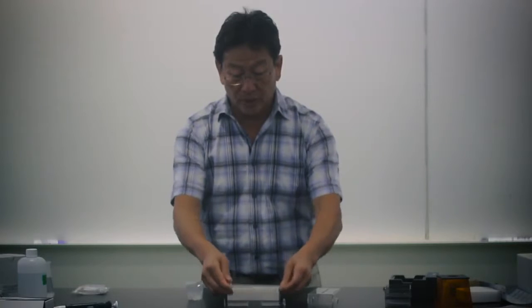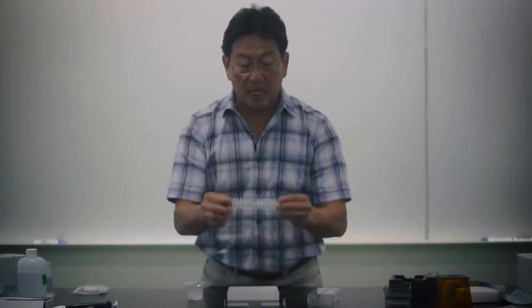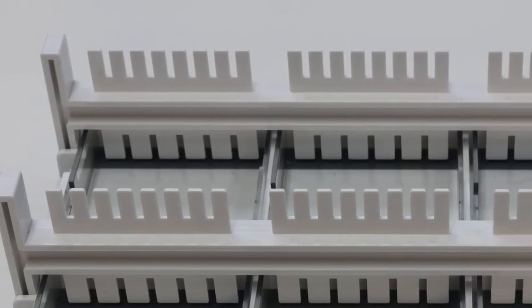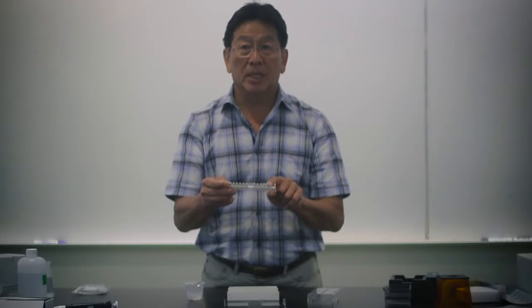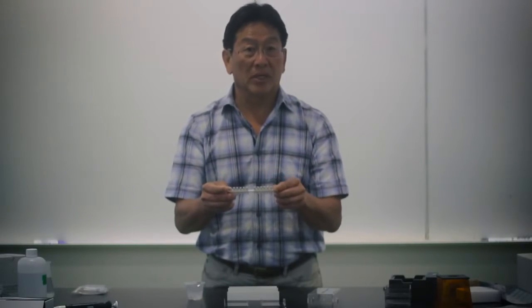Every system comes with two trays, and these trays are made with fairly thick bottoms so they are very good for repeated casting with hot agarose. It also comes with two sets of combs, which are fairly unique — they are designed so you can make six-well gels or nine-well gels. The nine wells are for PCR, giving you an extra well for the eight samples from an eight-strip PCR machine. The six wells are good for loading a lot of DNA and producing beautiful bands.